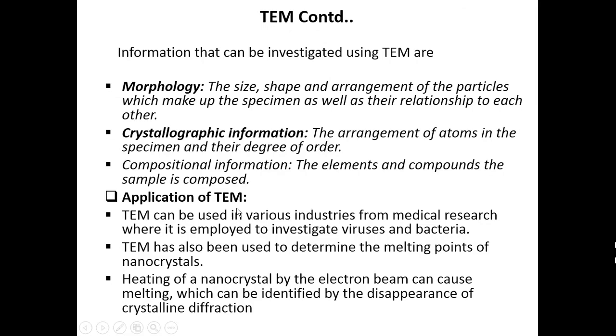Then, what are all the applications of TEM? Of course, we can find out these features of the sample, and TEM can be used in various industries, from medical research. In medical research it is very widely used to investigate viruses and bacteria. I told you already about coronaviruses and different kinds of bacteria. These biological samples can be identified, studied, and analyzed with the help of TEM, the transmission electron microscope.